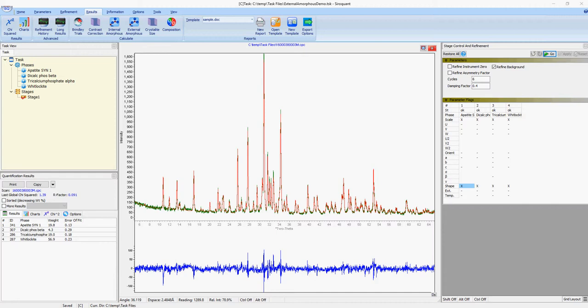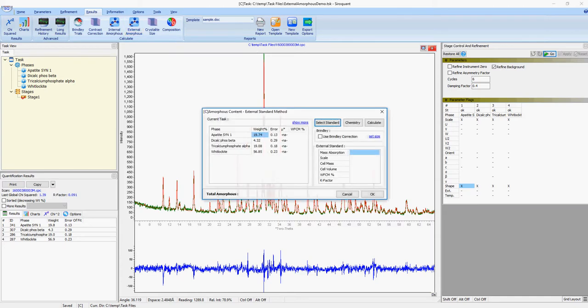Now that we have a refined sample, we will use the amorphous calculator to determine the amorphous content. The first step is to go to Results, External Amorphous to load the calculator.